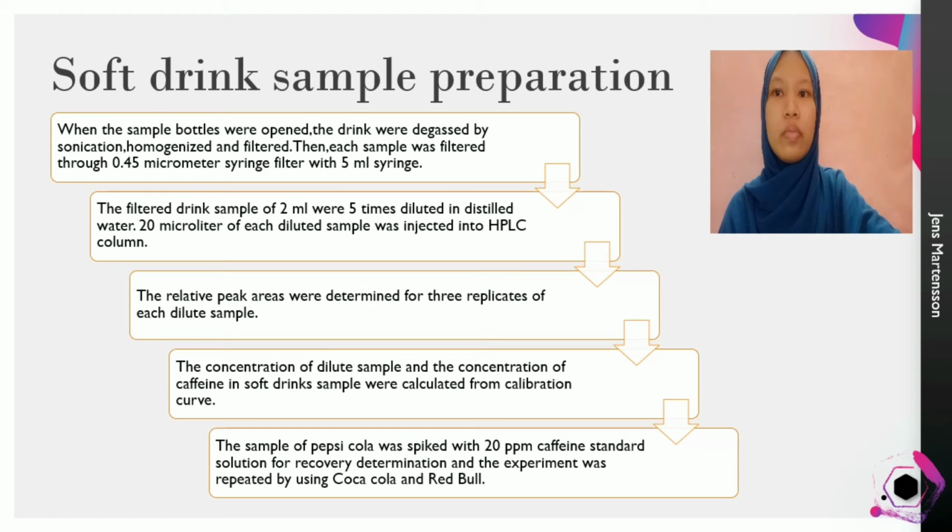The sample of Pepsi Cola was spiked with 20 ppm caffeine standard solution for recovery determination, and the experiment was repeated using Coca-Cola and Red Bull.